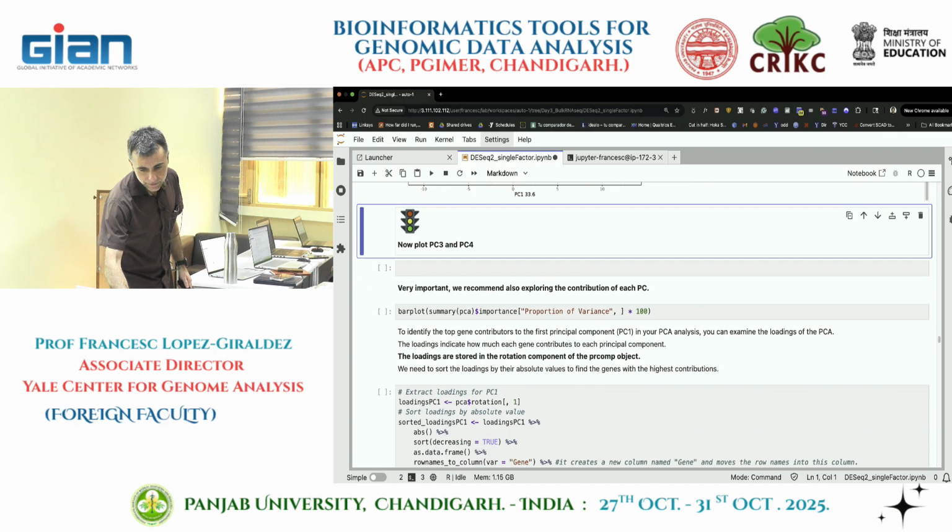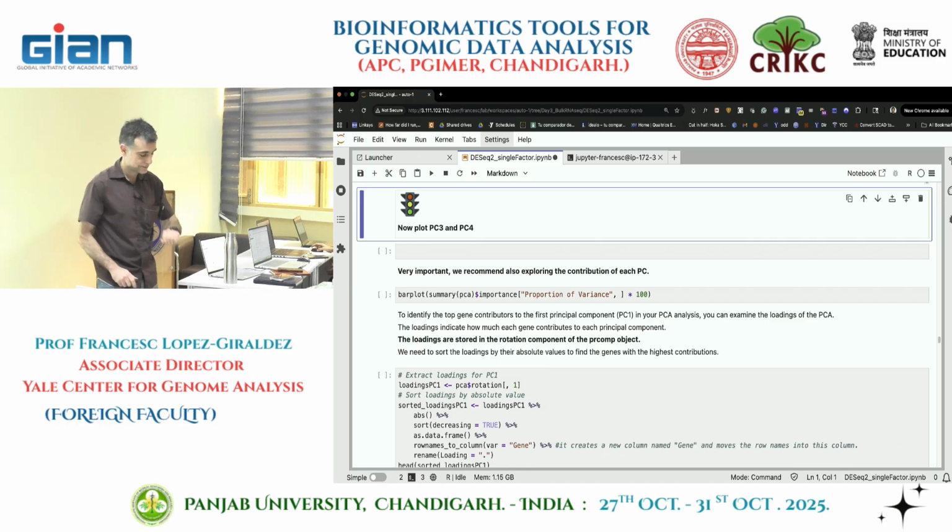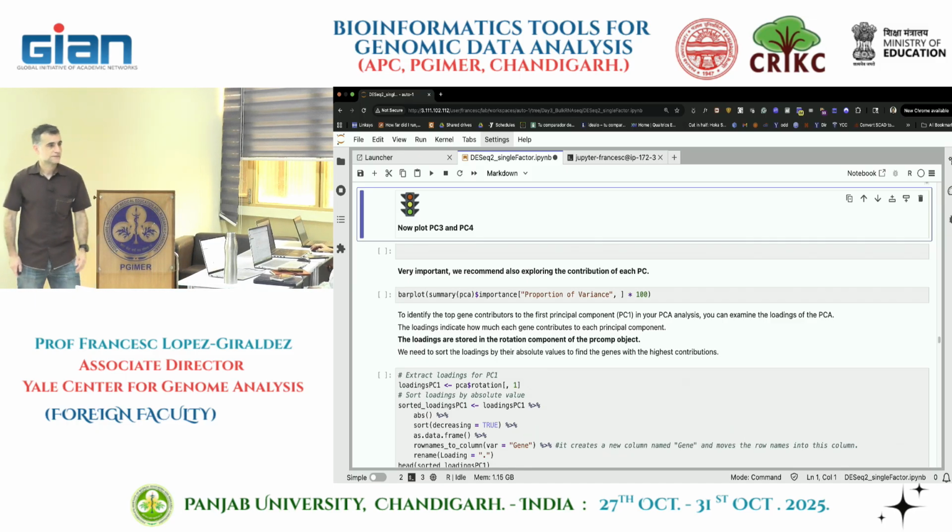Okay, can you plot PC3 and 4? Let's plot it.